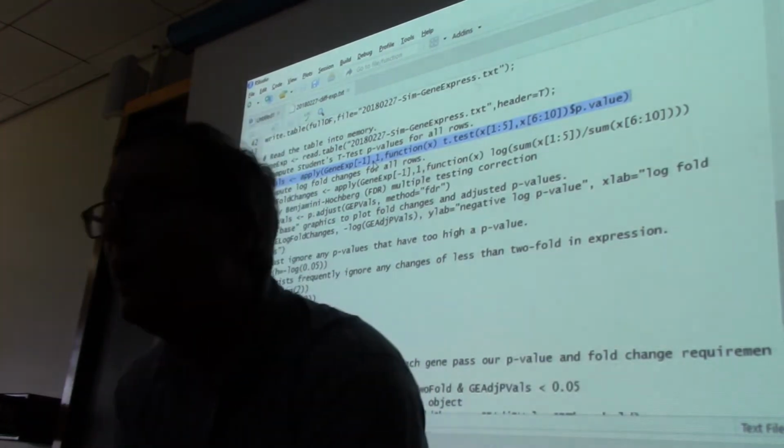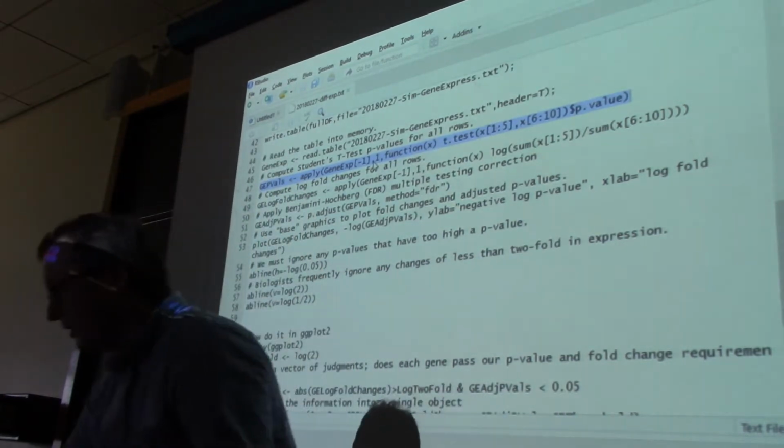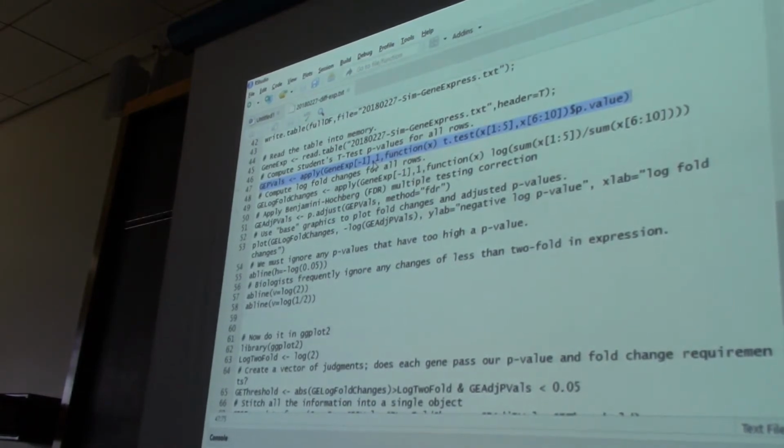Before you go back, I'm struggling with getting basically quite very well. I'm still on that Unix and trying to get those summaries and get that stuff done. Always getting an error. Okay. I'm going to take a quick look at what the error is. All right. Oh, it didn't correctly open.